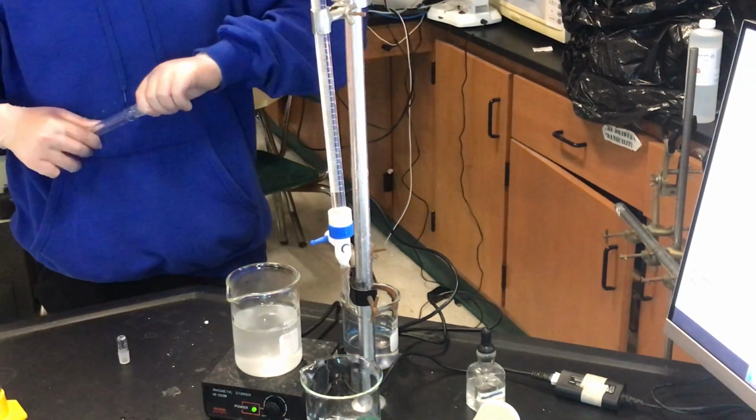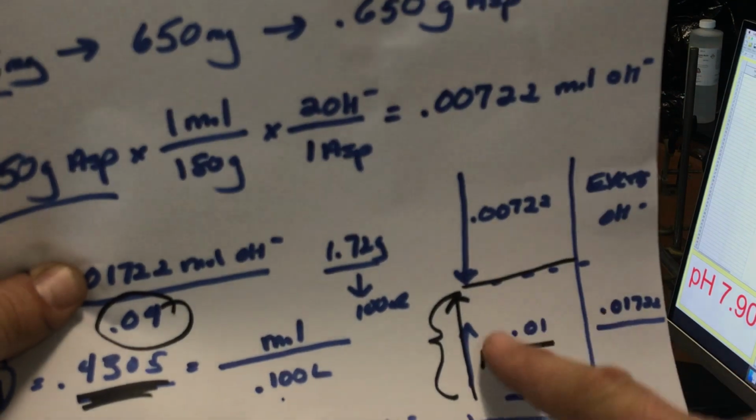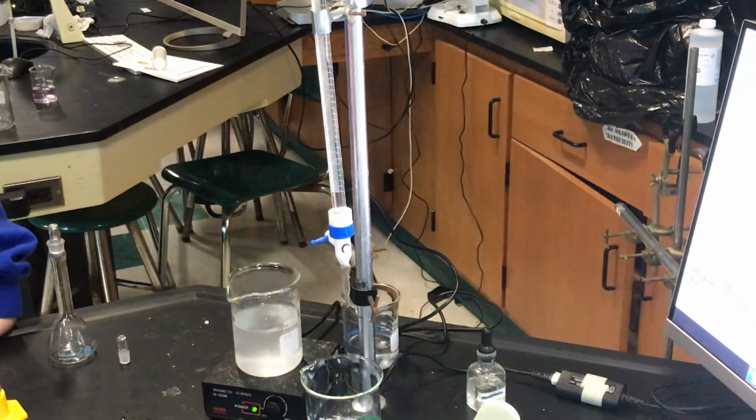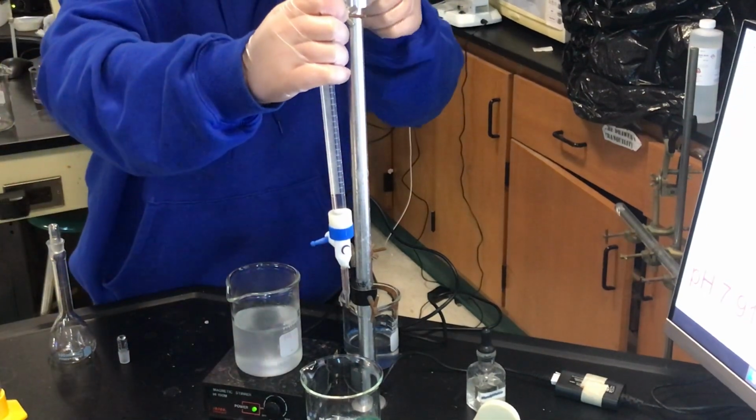So now where are we? Now we're going to titrate back. We want to figure out, okay, exactly how many moles of HCl. So we need the volume. Now we could use an indicator, but I want to use the pH probes. Make a graph. Okay, so Evan, could you please put that pH probe into the solution so it doesn't get in the way of student E.